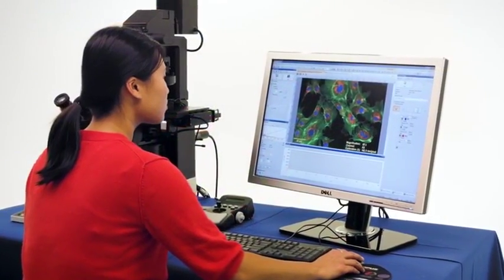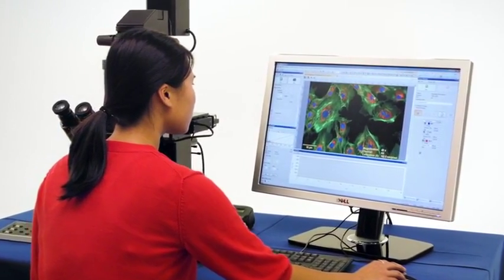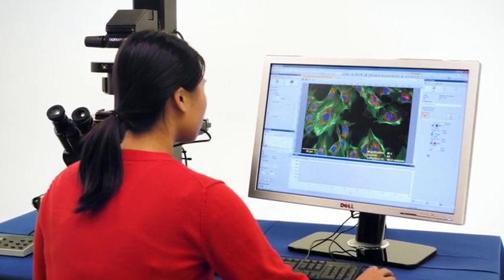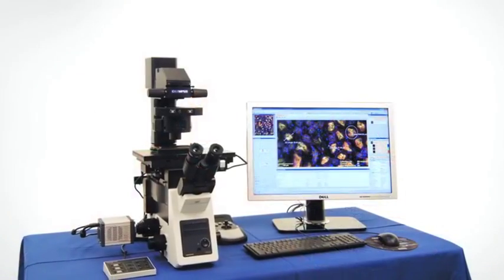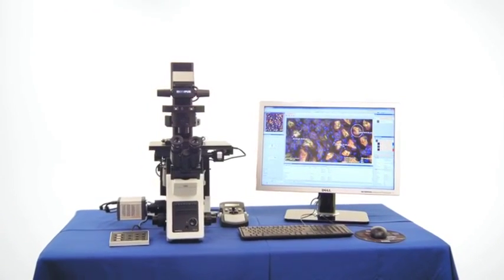With the Olympus IX-73 Smart and Semi-Automated Inverted Microscopes, the researcher's workflow is uninterrupted, meaning more time can be dedicated to extracting useful information.